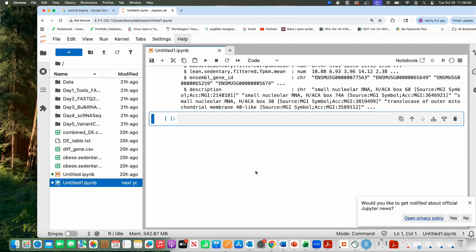So with any data that you get, you should first know whether what you were expecting to load into the workspace is there. You are looking at how many rows are there, so you are using the dim command for that. You are looking for dimensions, and it will give you how many rows and how many columns there are. Did all of you run that dim command? And then you are using str, the structure of your data, so it will give you all these different columns and their names and all those kinds of things.